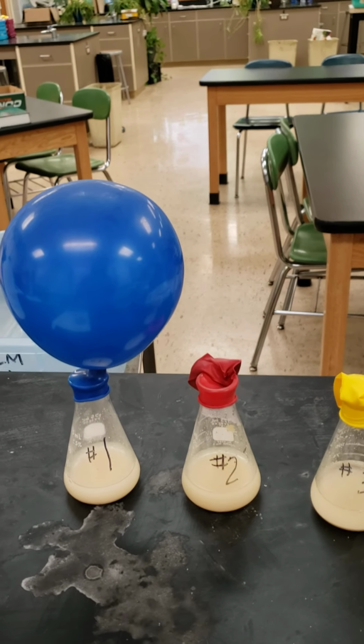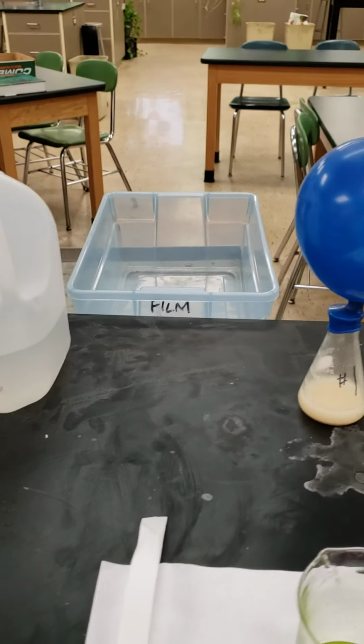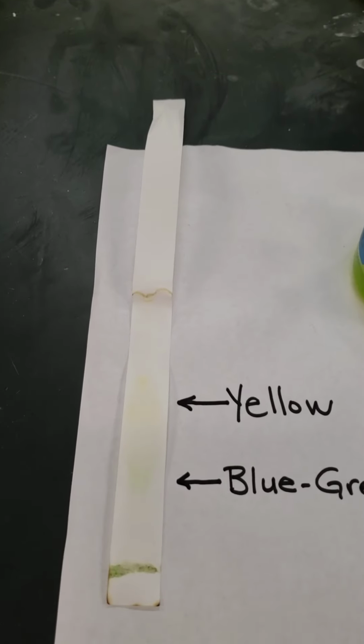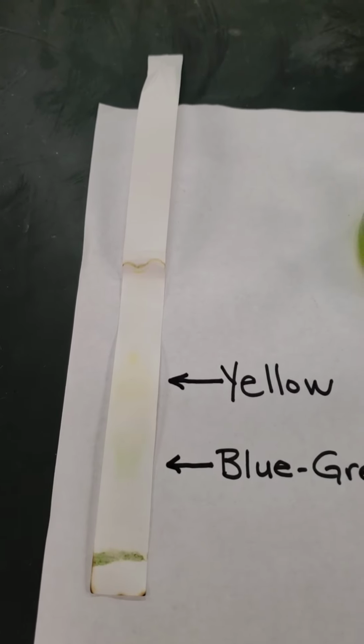But in the meantime, I also did the chromatography.